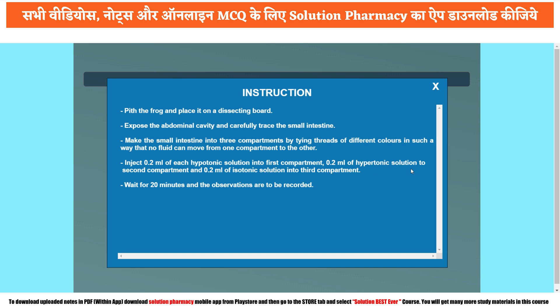Next, inject 0.2 ml of hypotonic solution into the first compartment, 0.2 ml of hypertonic solution into the second compartment, and 0.2 ml of isotonic solution into the third compartment. The quantity of injectable substance is the same, but because they are hypotonic, hypertonic, and isotonic, their concentrations will be different from each other — that is why this object studies the osmotic purgative or saline purgative effect. Finally, wait for 20 minutes and record the observations.